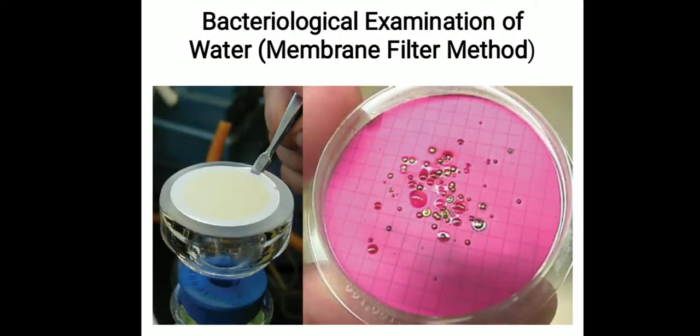One of the practicals that I'm going to discuss today is the bacteriological examination of water, or we also call it the water quality analysis by a membrane filter technique or membrane filter method.